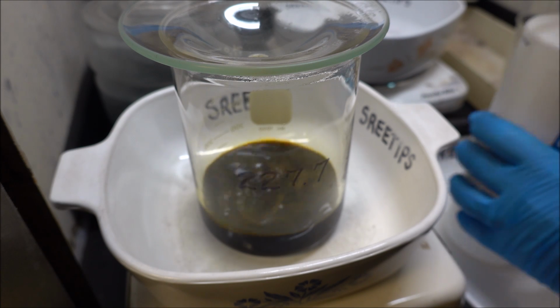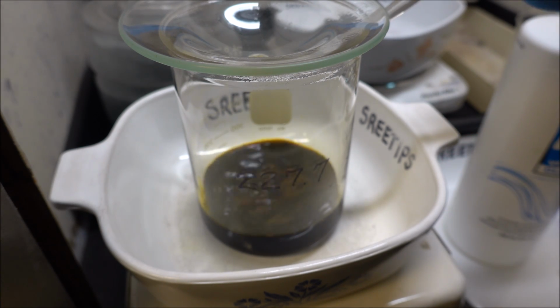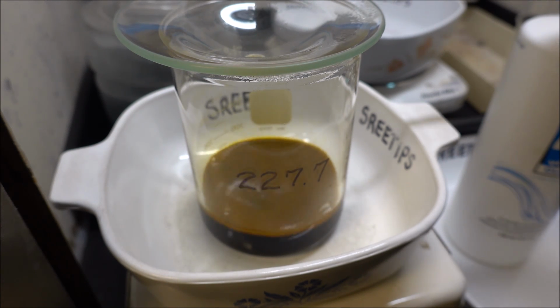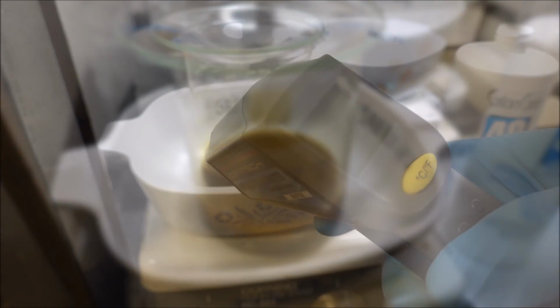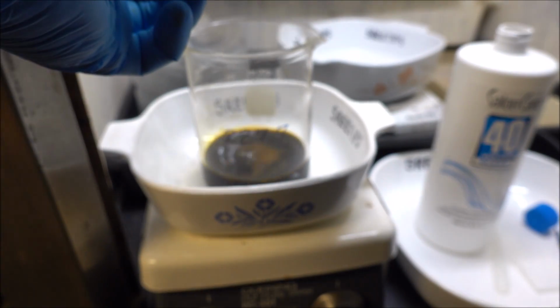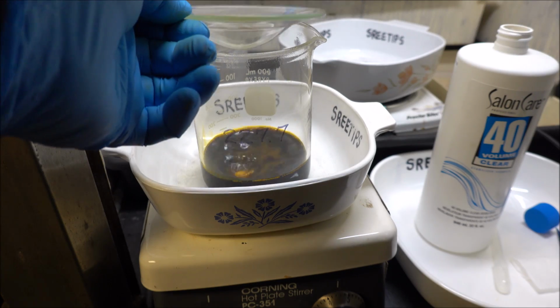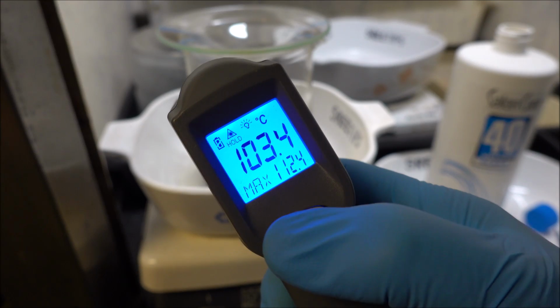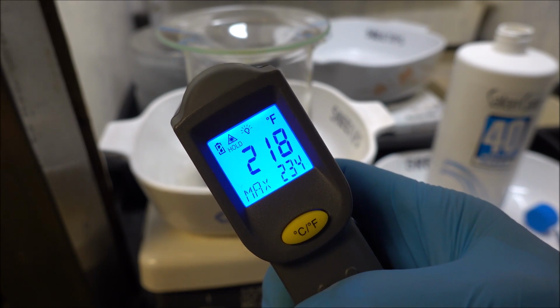This will be my 5th dropper of hydrogen peroxide. Adding it in just a little bit at a time. Reach in here and get a temperature on it right quick. We're at 103 Celsius, 218 Fahrenheit.